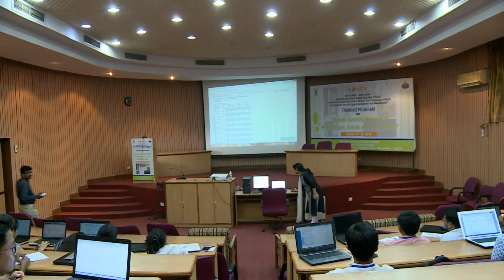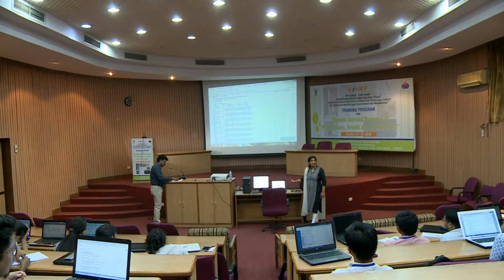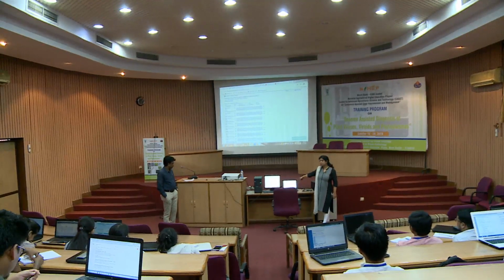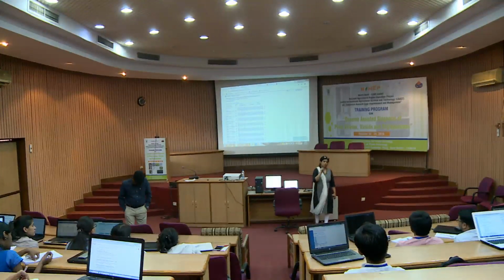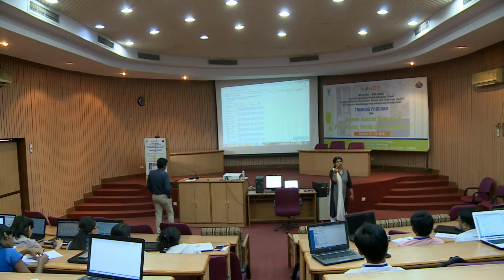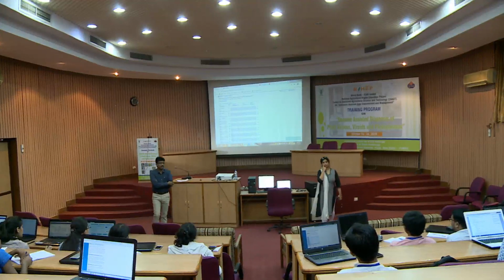You have to count from which base it starts up to which base, highlight that, and then cross verify whether your translation is the same, because if you shift even a single nucleotide, the whole frame will be shifted. That is the extra work that takes a lot of time, because you have to match base to base, and then take out this particular translation.